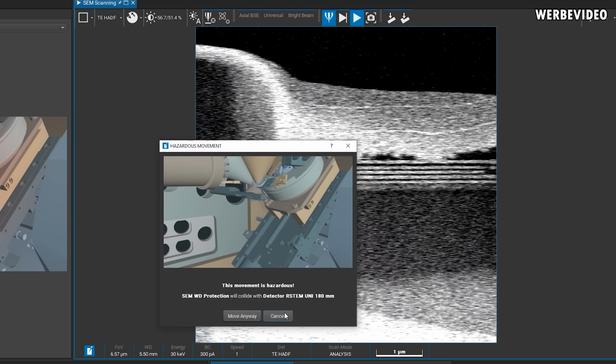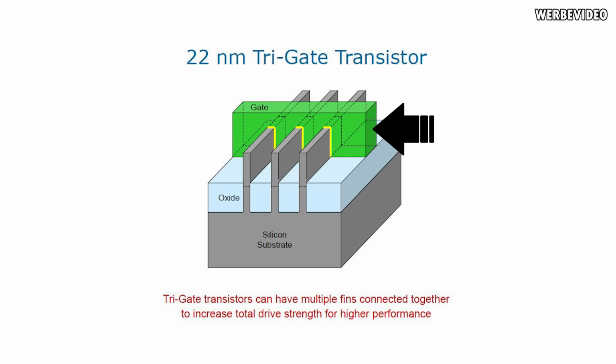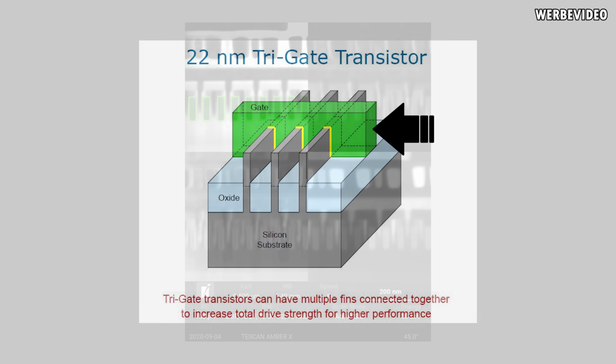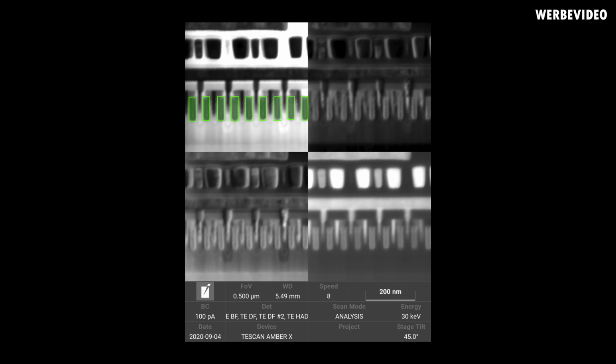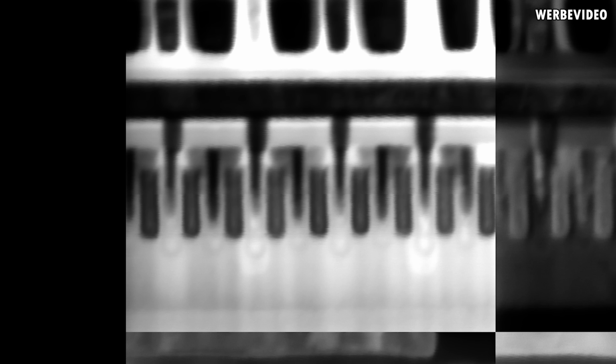And we were trying to perform the cut through the gate, so we're able to measure the gate length. As a quick reminder, in between, that was the FinFET transistor, and we're cutting through the FinFET from the side. What you can see marked green in the image will also be marked green now on our cutting image, and the dark areas which we can see within, those are the gates. That means we're seeing a lot of 7nm transistors sitting next to each other where we cut through.